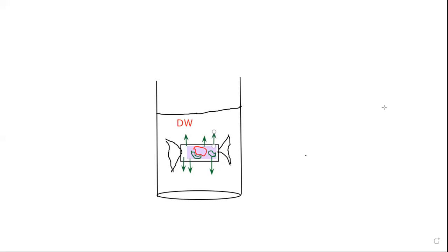And I'm going to change this distilled water repeatedly, 5 times, 6 times, or 3 times, depending upon the level of purity that you get. When you do the same process 3 or 5 times, most of these ligands are going to come out of the dialysis bag, and what will remain inside is the desired molecule.